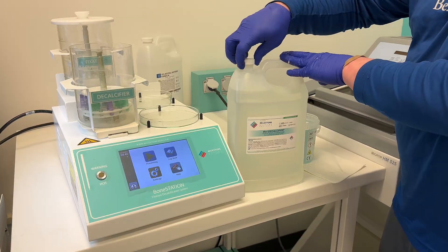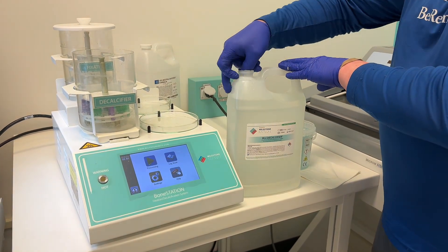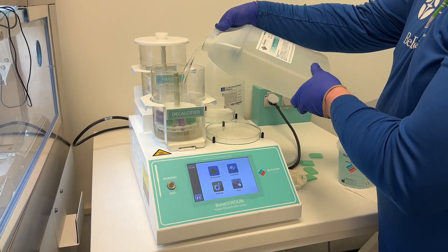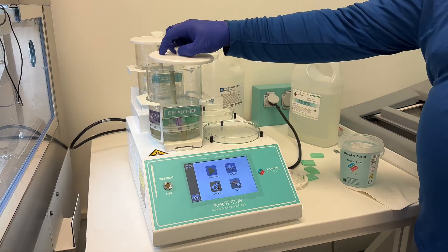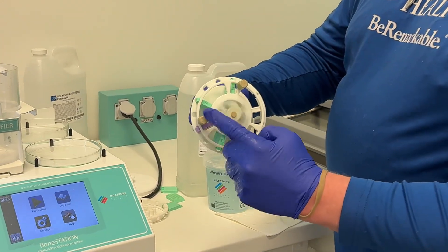For the EDTA decal sample, we made a quick stop at the bone station. We placed the cassette into the bone station and added Mol-Decalcifier, our unbuffered EDTA solution, until it covered the top of the cassette. Then we closed the lid and started the decalcification process. The stir bar in the beaker kept the solution moving.